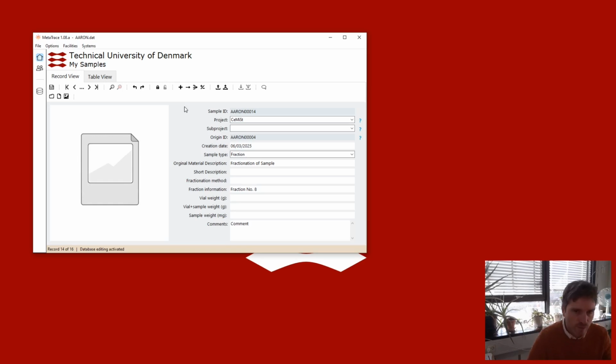The idea around creating records, you'll notice that there isn't actually a remove or delete record. The reason for this is that we can't delete records, because if we make a connection, say, between 12 and 14, and at some point we, for some reason, delete 12, then 14 no longer really makes sense because it came from 12.